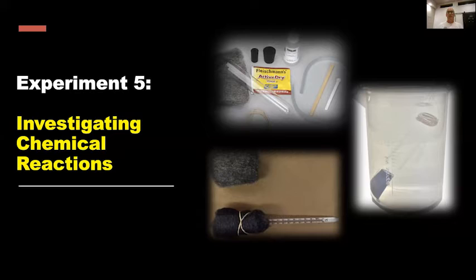I am going to show you how to do the magnesium and HCl reaction, because that's a little tricky to set up and get run properly. Unfortunately, I don't have any concentrated HCl left. So I'm going to have to try and make it work with dilute HCl. So I'm not sure it'll work properly, but I will show you how to get it all set up. So let's get into it.